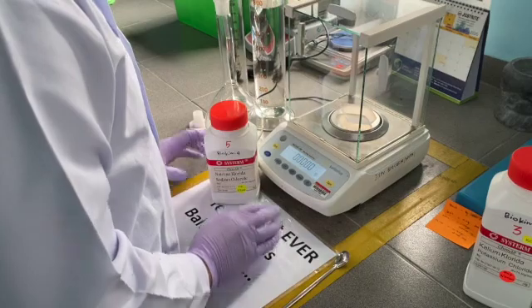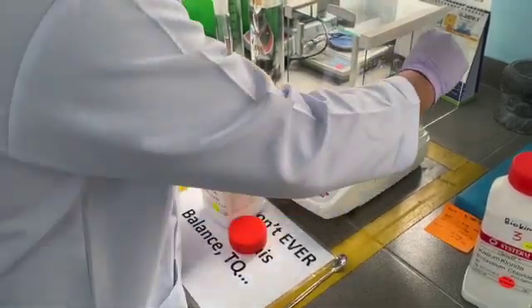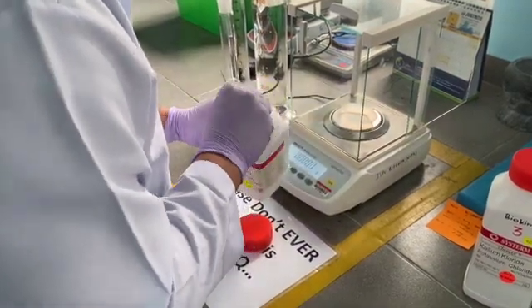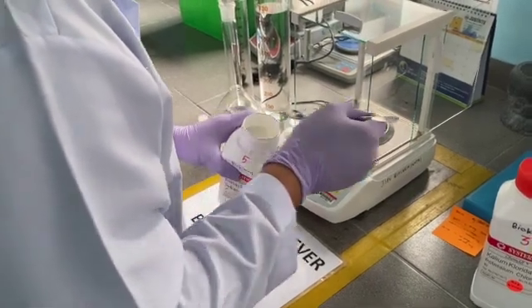All salts will be weighed carefully using a balance. First of all, we will have to make sure that the weighing boat is re-zeroed, and then we will scoop the salt out into the weighing boat.